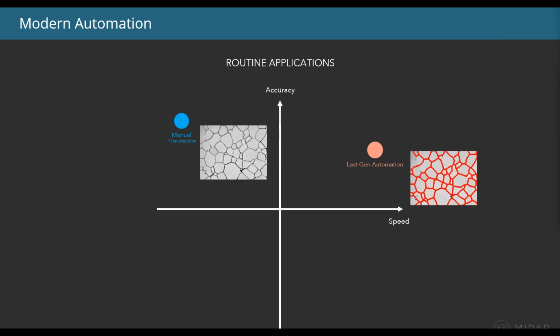And when you look at modern automation's impact, while it can offer marginal improvements in speed and accuracy, it's usually not worth the upgrade from classical tools, and it certainly doesn't tip the scales in terms of automation adoption if the last-gen automation technologies didn't do it for you.